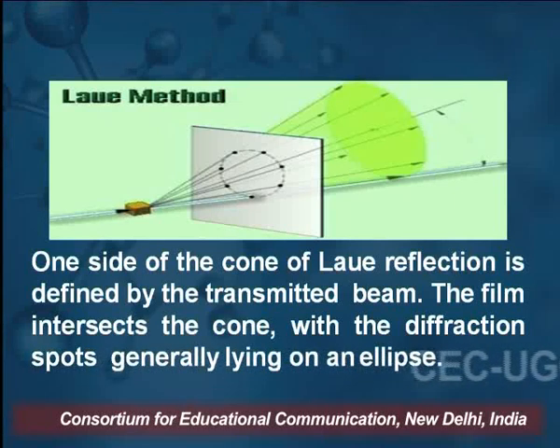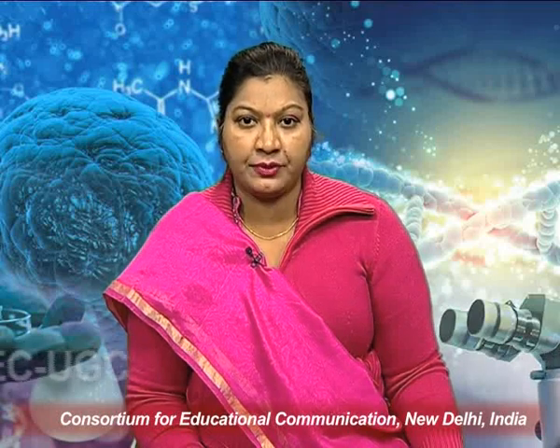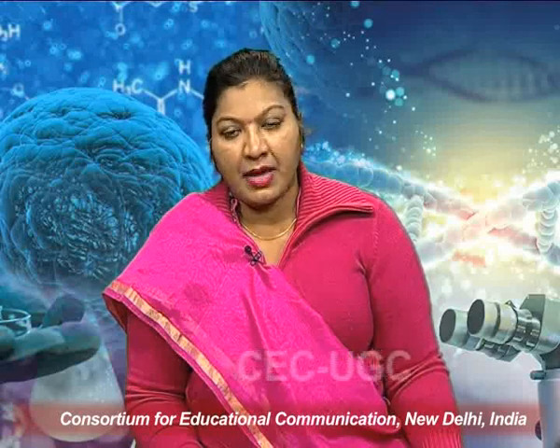The film intersects the cone and the diffraction spots generally lie on an ellipse. In the previous one, the back reflection, the pattern is in the form of a hyperbola. Here in the transmission, the pattern is spots in the form of an ellipse. So these are the two different Laue methods, back reflection and transmission.